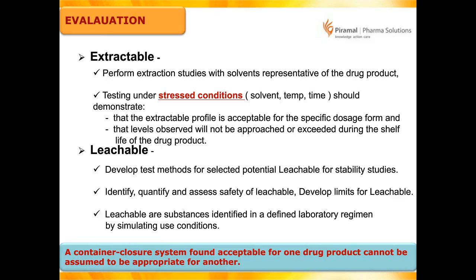Also, you need to have different types of techniques, whether you need identification for that particular impurity, whether it is qualitative or quantitative. So you need to identify, you need to quantify. Also, you need to have the safety assessment of that particular leachable. There are different techniques where you can do the safety assessment. A safety assessment can be done by toxicologists, or there is software, such as DEREK, one of the well-known programs. Once you have identified the component, you can run it through the software and assess the safety of any leachable.